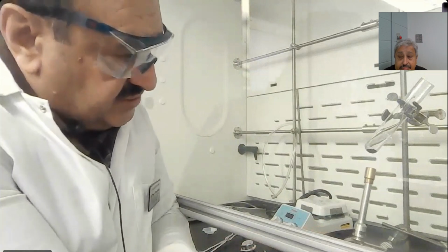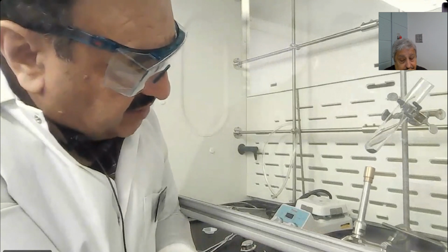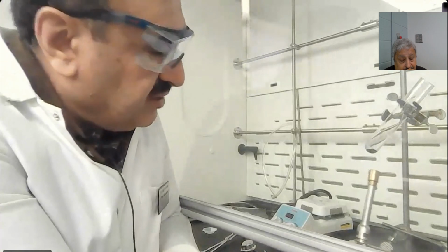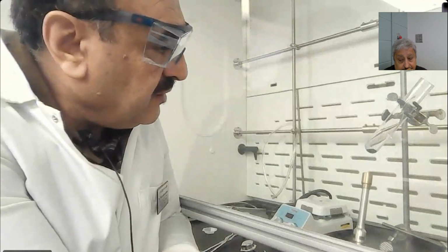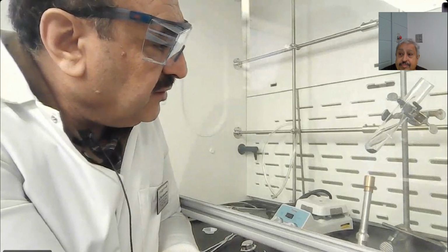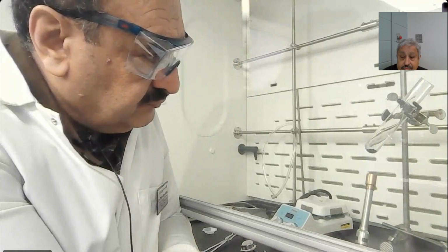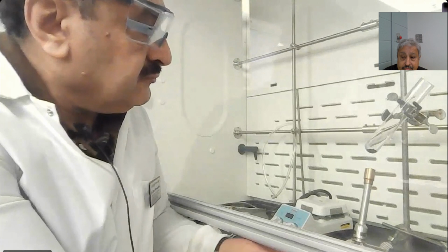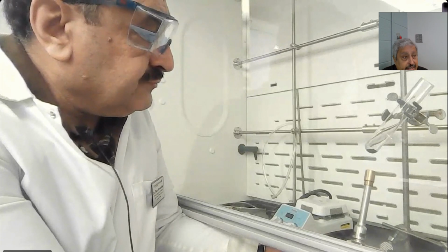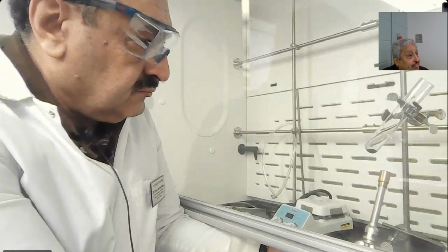Put it for 1 minute, just to make sure that all the utensils will be warm enough. And we'll bring in the manganese dioxide to be dry without any moisture. And anytime you want to keep the test tube cooling inside the clamp, don't take it out to cool it.